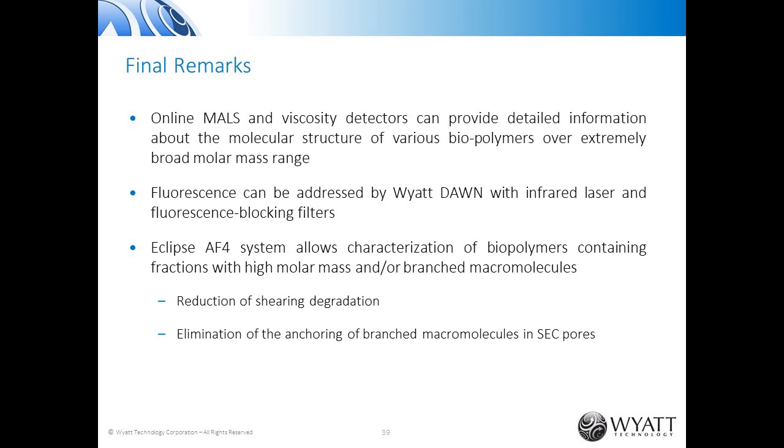Can you utilize a viscometer to characterize the difference in density of similar biopolymers? Yes, it can, because a viscometer measures intrinsic viscosity. Intrinsic viscosity, the unit is milliliter per gram. That means that it is the volume of the polymer coil related to the mass. That means that actually it is the reverse density, but we are talking about the density of the polymer coil, not about the bulk density of the material as it is. Yes, it can be used for this.